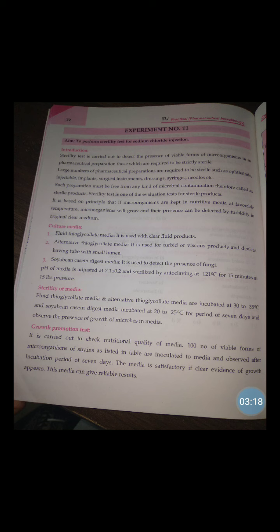The fluid thioglycolate media and alternative thioglycolate media are incubated at 30 to 35 degrees Celsius, and the soybean casein digest media is incubated at 20 to 25 degrees Celsius for a period of 7 days, and the presence of microbial growth in the media is observed.